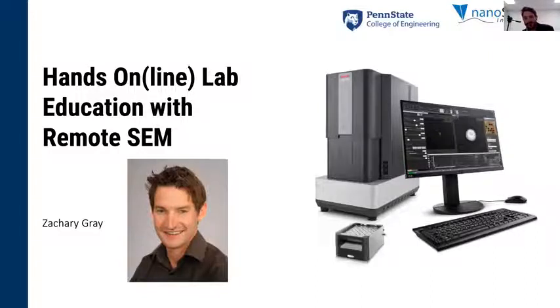So I want to talk to everyone today about the remote access of the scanning electron microscope, along with just the scanning electron microscope in general as a technique, and why it's important, I think, for students to get this as an experience and a skill set.